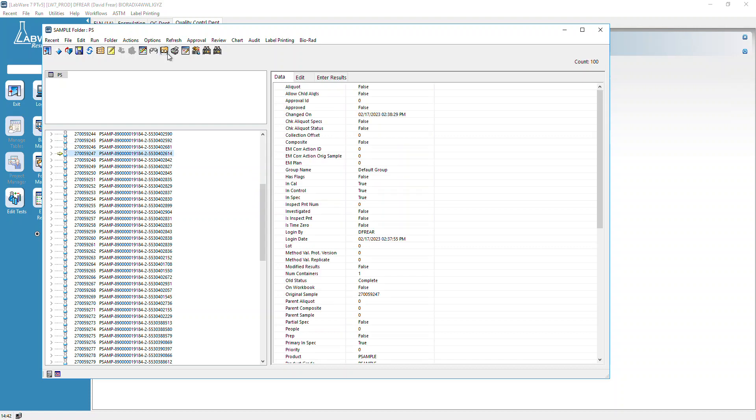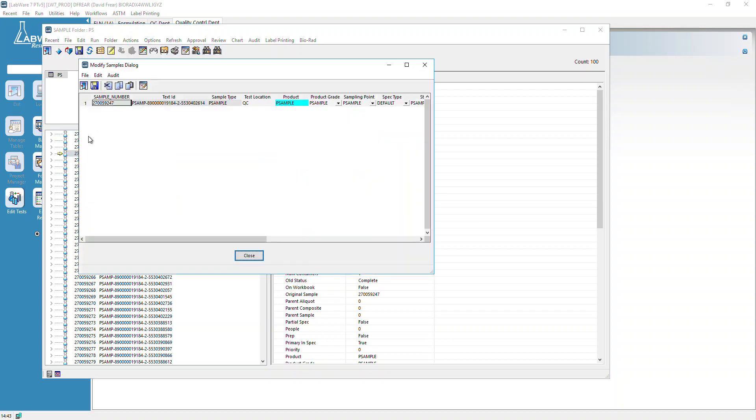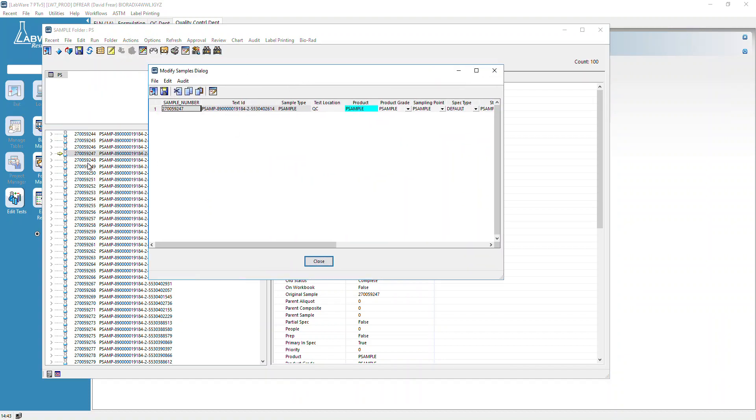Sample numbers are sequential, as long as no one else is logging samples at the same time. If we find that sample that's a duplicate, we can go into it, highlight it, and then go to Options, Modify Selected Samples. If you do Modify Samples, it's going to open all the records - that'll take some time. We're going to modify them individually.